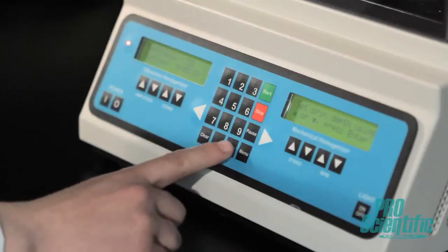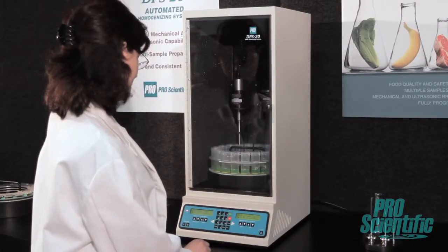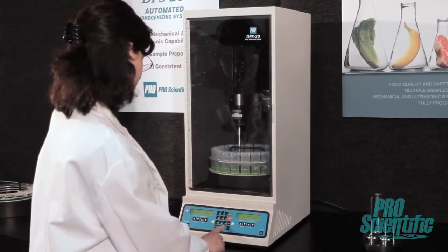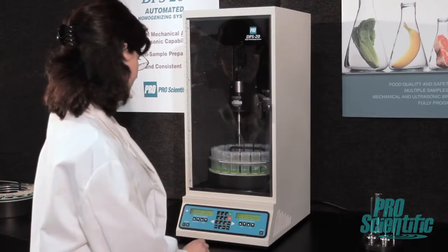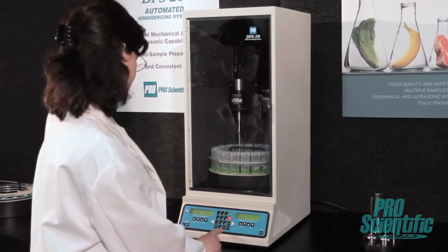Regardless of which mode you're using, programming of the DPS20 is simple. Programming is completely menu-driven using a keypad and two LCDs. Once you know your desired speed and time, programs can be easily stored so there's zero operator variability. The DPS20 can also be used in manual mode for quick runs. You simply set your parameters and go. During processing, the dual backlit display clearly shows your parameters along with the estimated total processing time.